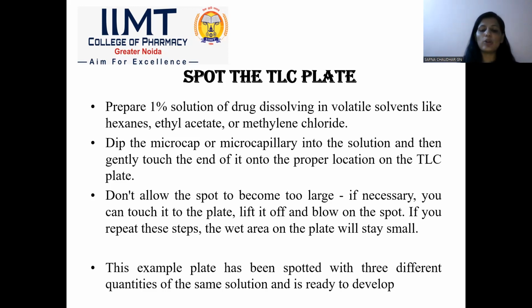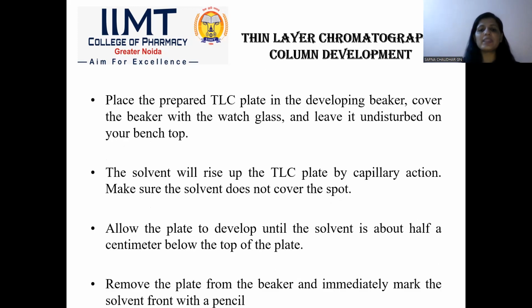This example plate has been spotted with three different quantities of the same solution and is ready to develop. Next, place the prepared plate into the developing beaker, cover the beaker with the glass, and leave it undisturbed for the distribution of the solvent. The solvent will rise up the TLC plate by capillary action.